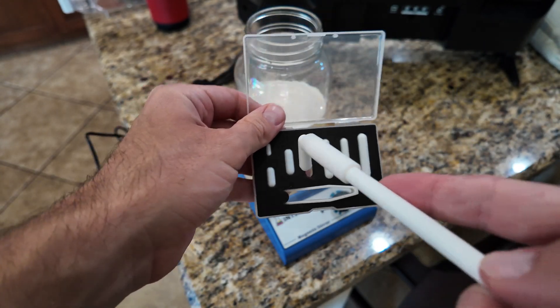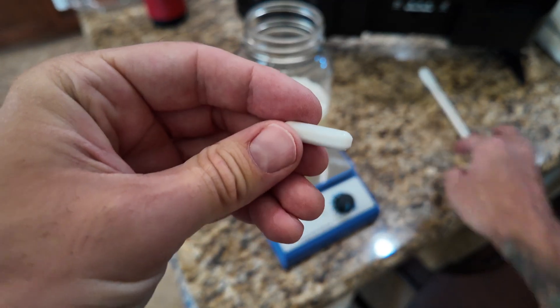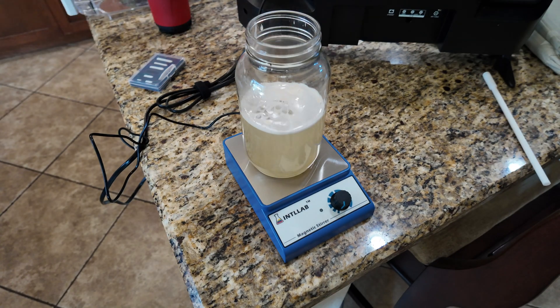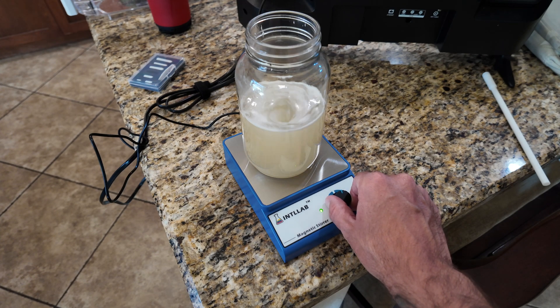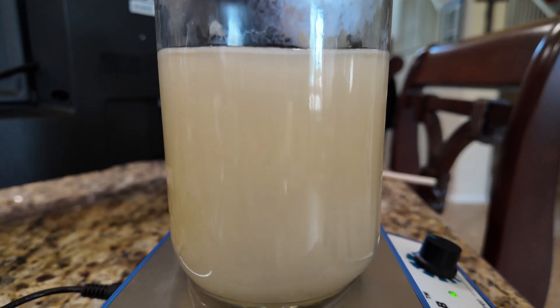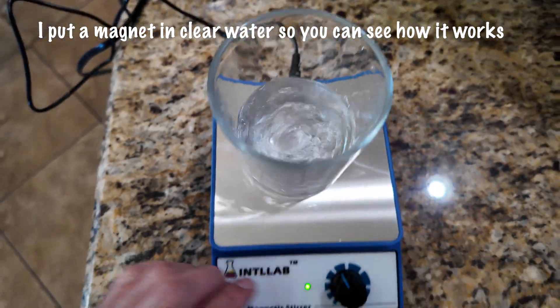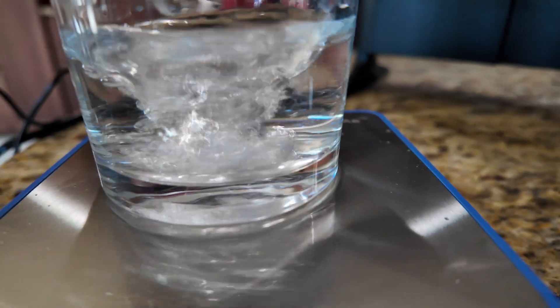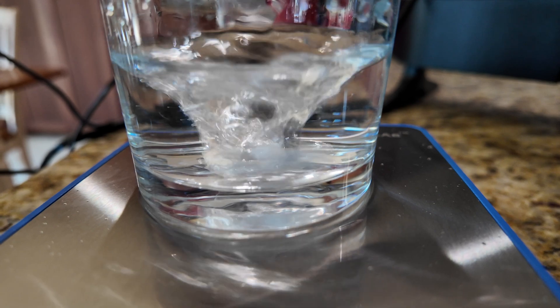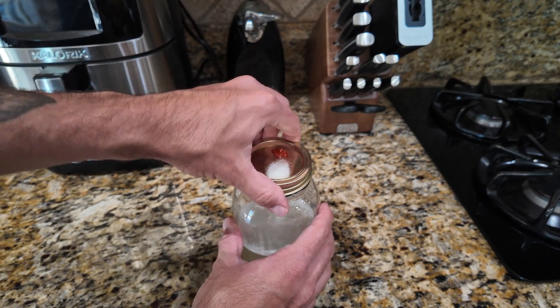This is an optional step, but this is where I drop my magnet in. If you choose to skip this and just swirl by hand, that's totally okay. However, when it comes time to draw your liquid culture into a syringe, I've found swirling by hand makes it much harder to break up the clumps of mycelium than using a magnetic stirrer. This stirrer is about $20 on Amazon and it improves the quality of your liquid culture a good bit. After everything is mixed up, we'll put our lid on, cover it with foil, and drop it into the pressure cooker.